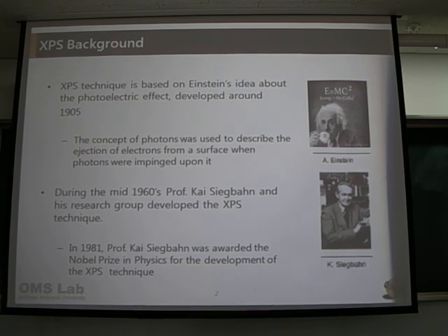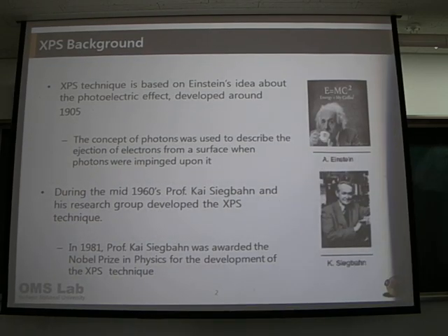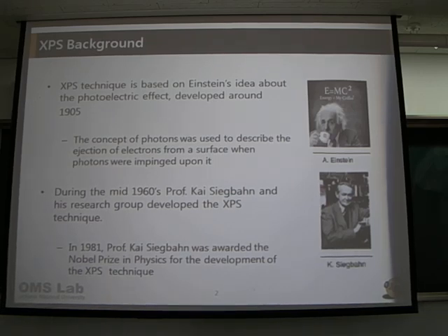During the mid-1960s, Professor Kai Siegbahn and his research group developed the XPS technique. For this reason, in 1981, he was awarded the Nobel Prize in Physics for the development of XPS techniques.